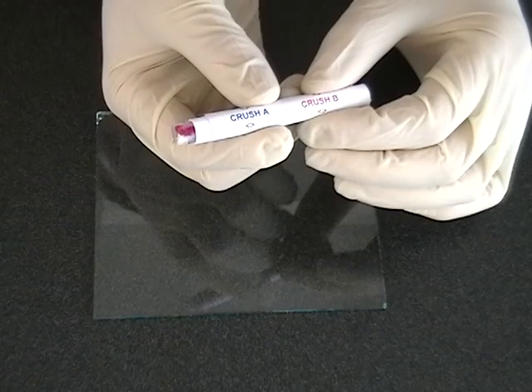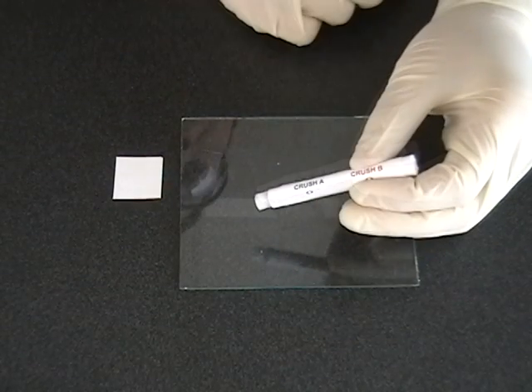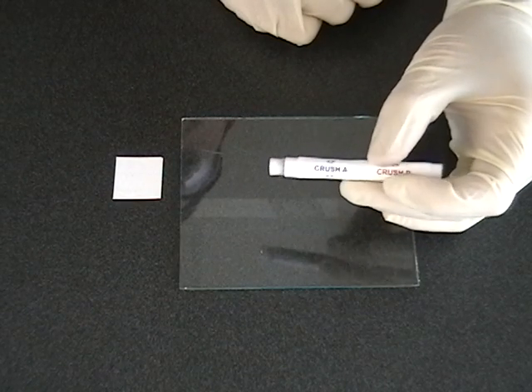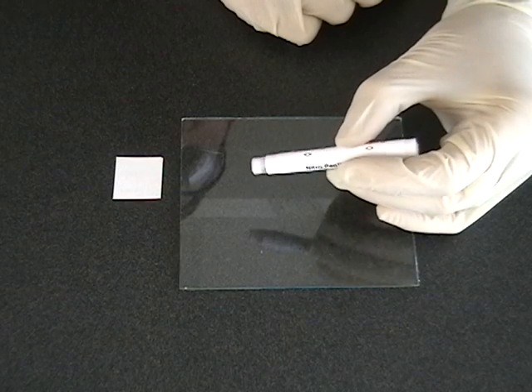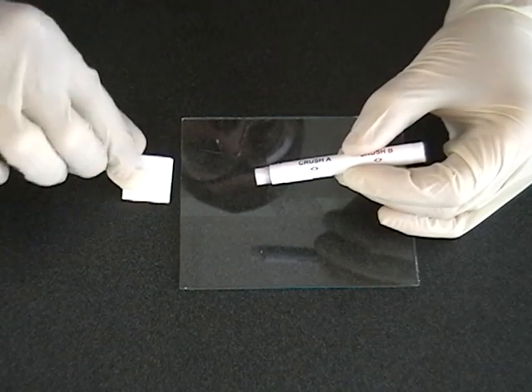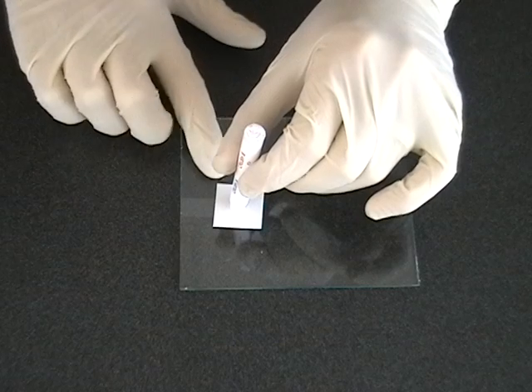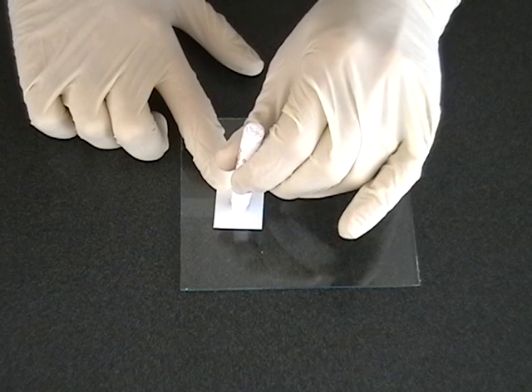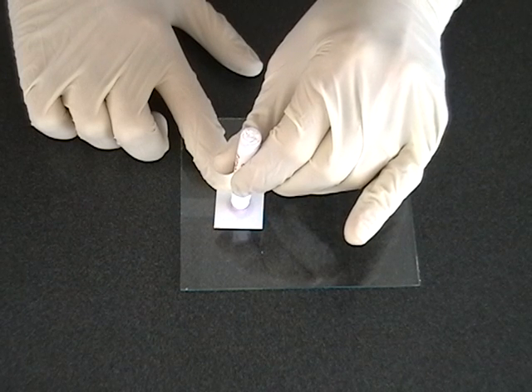We are now going to demonstrate the detection of inorganic nitrates using the nitro pen and Z-pad, available with the nitro pen 02 and nitro pen 04 models. Proceed as before, first breaking ampule A and wiping the suspect surface. Wait 30 seconds for a color to develop. Next, break ampule B, allowing the solution to mix with the ampule A solution on the swab. Wait 30 seconds. Since no color has developed, we can proceed with the detection of inorganic nitrates. Press the swabbing tip with the ampule A and B solutions already mixed to the surface of the Z-pad. Hold for 15 seconds. If a pink or purple color forms on the tip of the detector, or on the Z-pad as you can see here, there are inorganic nitrates such as ammonium nitrate on the suspect surface.